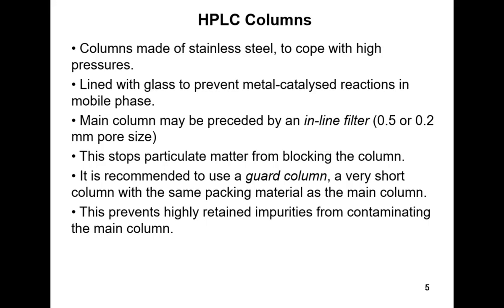In addition, you'd also use a guard column, and this is just a very short column with the same stationary phase. The point of this is if you've got something going into the system which will interact very strongly with the stationary phase, it can get stuck there.